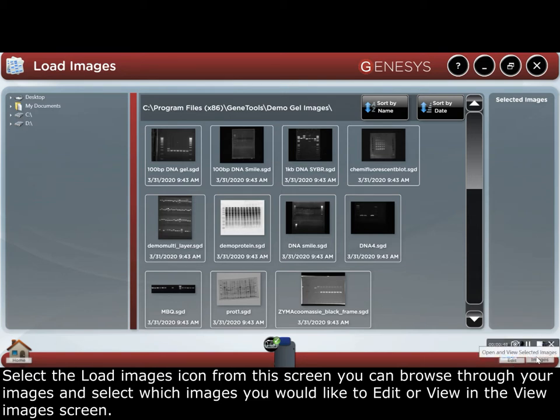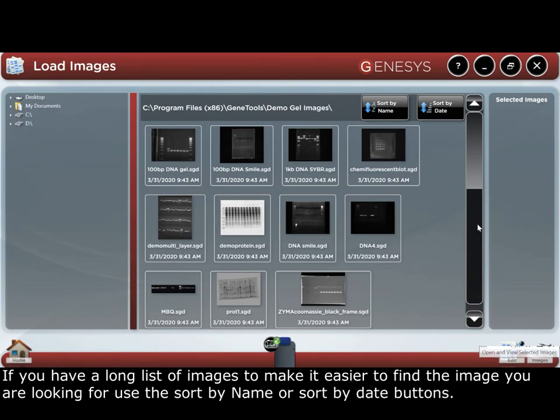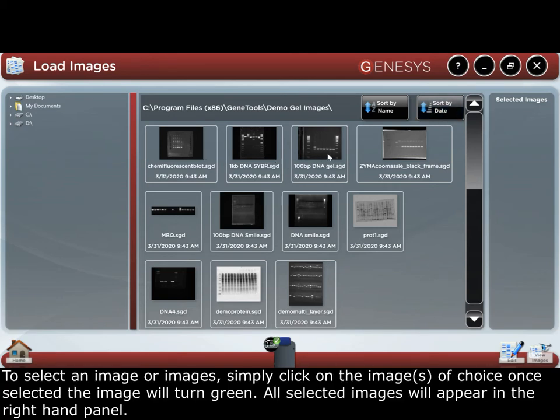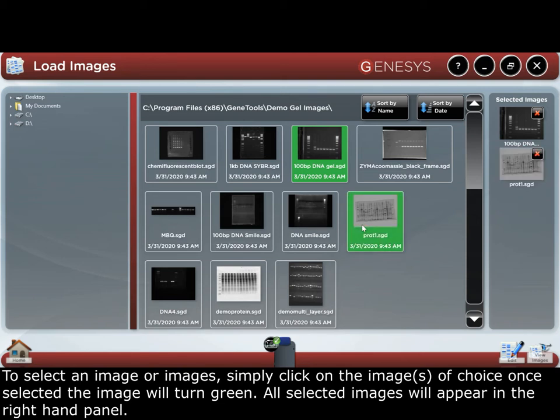In the view images screen, if you have a long list of images, to make it easier to find the image you're looking for, use the sort by name or sort by date buttons. To select an image or images, simply click on the image or images of choice, and once selected, the image will turn green.